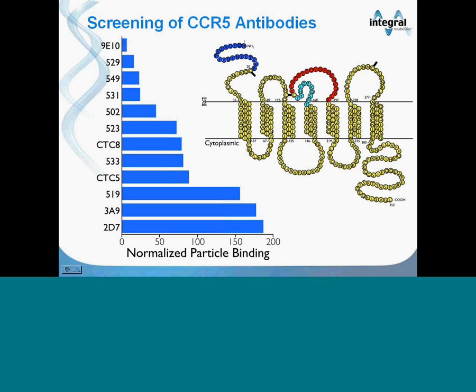So this approach can be used for screening hybridoma supernatants, or really any molecule that can be attached to the chip surface. And as I said before, it's a very sensitive assay because of the size and the multivalency of the lipoparticles.